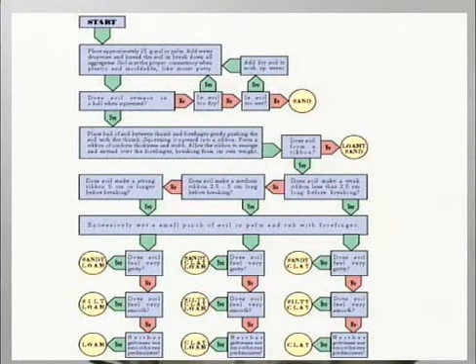In this exercise today, we are going to be estimating the soil textural class using a flow diagram which is found in your laboratory handout on page 4. This procedure will take us through examining the soil in a dry condition, wetting that soil to where it becomes moldable or in a clay consistency to determine how well it will ribbon, and I'll explain this as we get into the actual pan samples of soil, and also wetting this soil to a very saturated condition whereby we will be able to determine the amount of grittiness or sand that is in that particular soil sample.